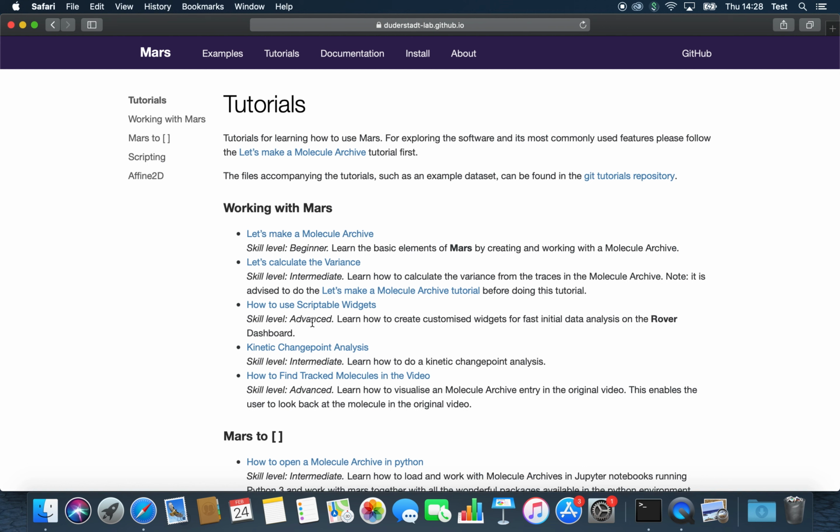In this video series, I will guide you through the basic functions of Mars. You will learn to create an archive, calculate some summary statistics of the traces, visualize them, do some further analysis, and find back the molecules in your dataset.